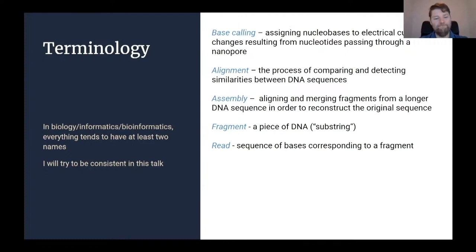And then another thing you might want to do in the data processing is alignment. If you have two sequences of A's, C's, T's, and G's, like the DNA sequence, you might want to see if there's an overlap, and if they fit together somehow, kind of like the basic elements of starting to puzzle it together. And if your goal is to assemble all of these things into a full genome, that becomes more of an assembly question. It's more a terminology difference between alignment and assembly, but there is an important distinction here that I'll get back to.